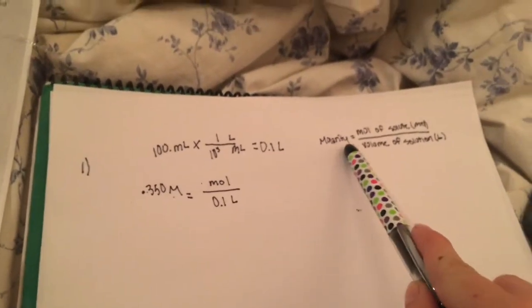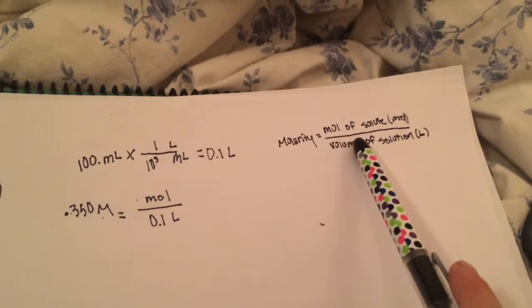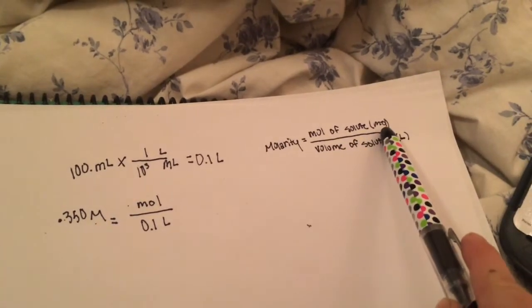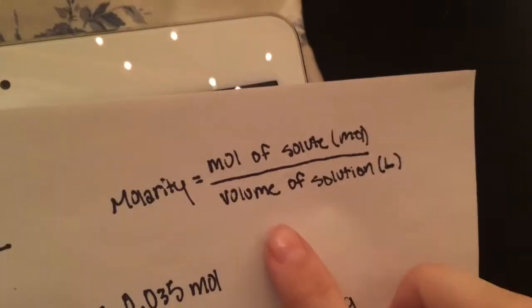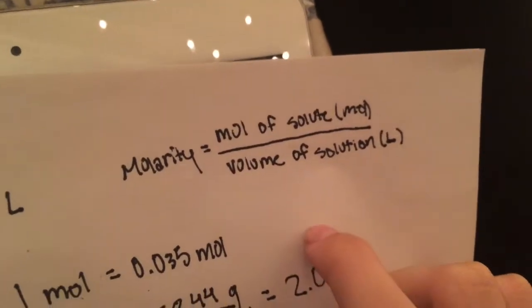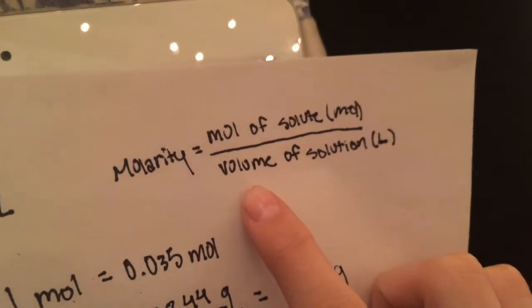The formula we're going to use is molarity equals mol of solute, which is in moles, over volume of solution, which is in liters. We are using this formula because we are using a solid solute, NaCl, which is salt.